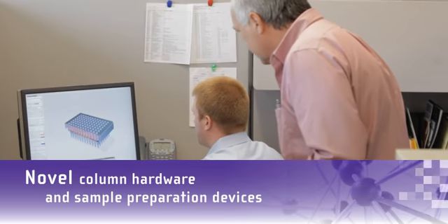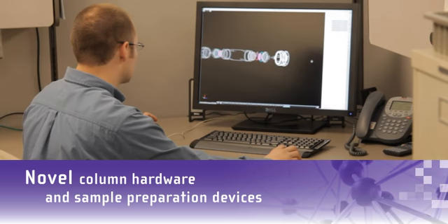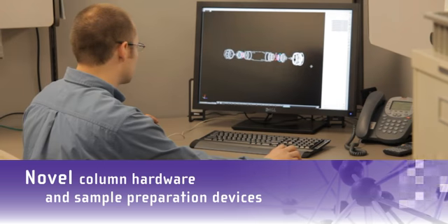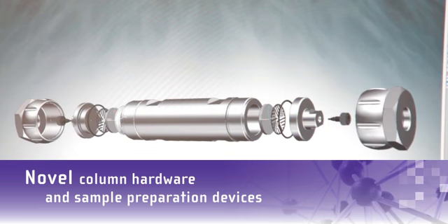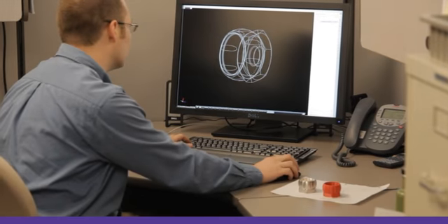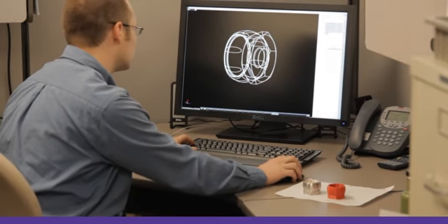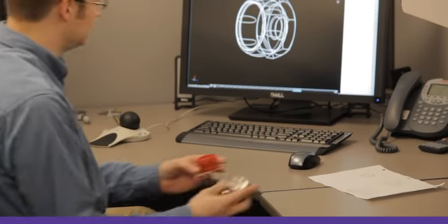The other important component of chromatographic columns and solid phase extraction devices is the steel or plastic hardware that contains the particles. Everything from the composition to the dimensional tolerances can impact the product performance. Our products span a wide range, from 75 micron capillaries to preparative columns with an internal diameter of 5 centimeters.